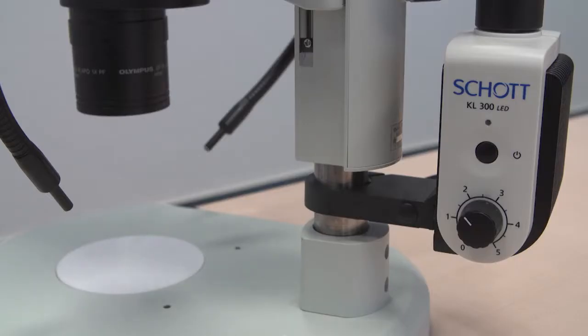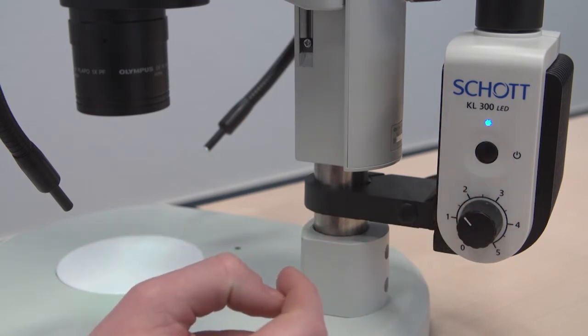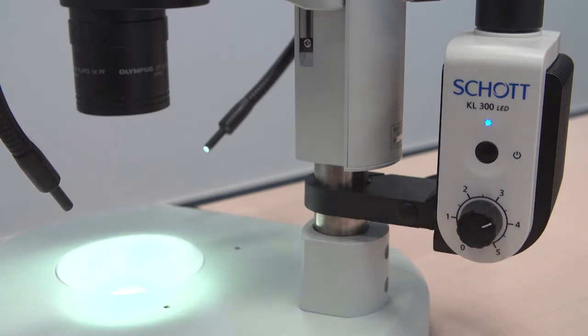To turn it on, simply push the on and off button. The light indicates that it is on and ready to operate. Now to adjust the light intensity, simply turn the dial. As you can see here, the light never changes colors. This light source has a lifetime of up to 50,000 hours.